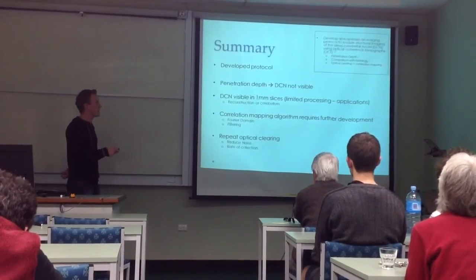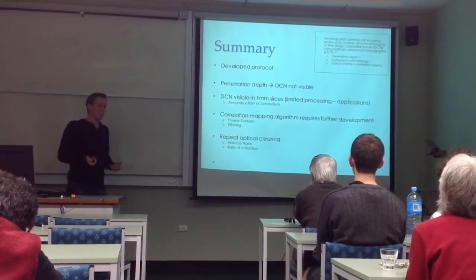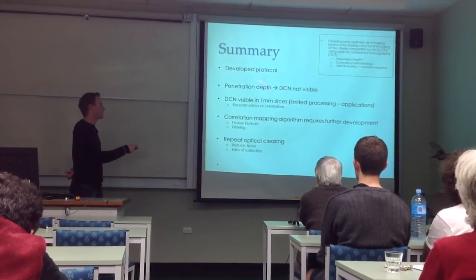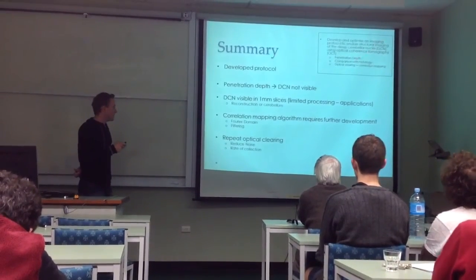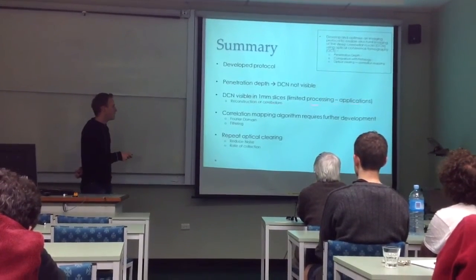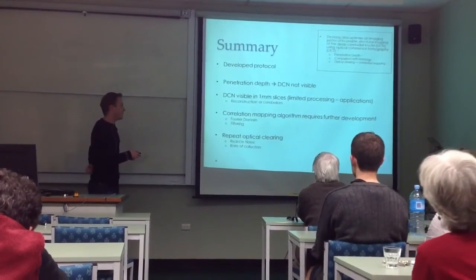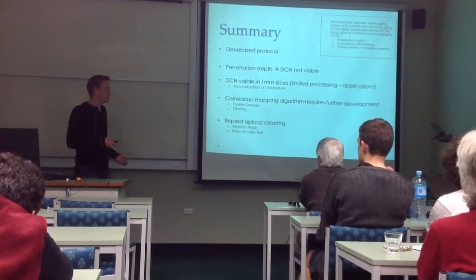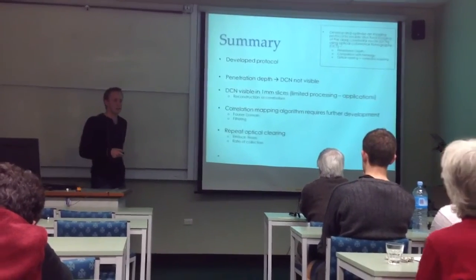So just to sum up and link back with my aims, I've developed a protocol for imaging brain tissue, which had not been done before. We discovered that the penetration depth was not what we wanted, but it has been done. And we then sliced it up and found lots of structural information, which is really promising and really great information. And we have now eliminated the need for costly and time-consuming processing. You just slice them up and away you go.